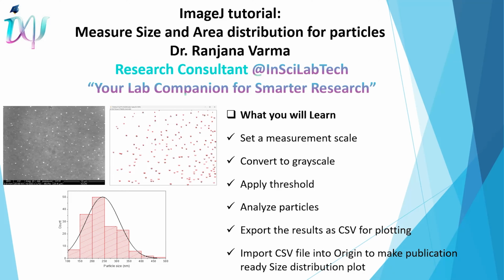What we are going to learn today: how to open your image file in the ImageJ software, how to set a measurement scale, convert an image to grayscale for analysis, how to apply threshold for isolating particles under consideration, analyze the particle for determining the size, export the result as CSV file for plotting, import the CSV into Origin to make a publication ready size distribution plot.